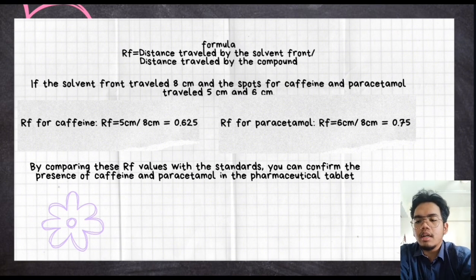By comparing these RF values with the standard, you can confirm the presence of caffeine and paracetamol in the pharmaceutical tablet.